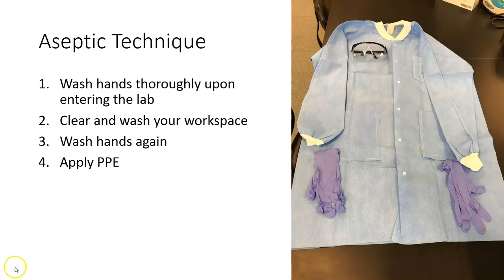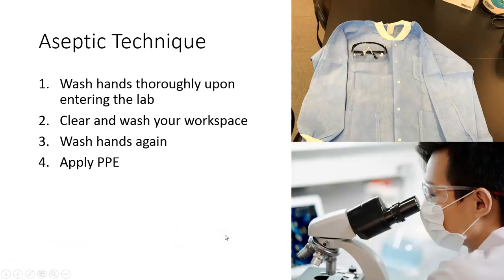Be certain that if you're wearing goggles in the lab, which you should be, the goggles have closed sides like these, so that splashes that might occur to the sides of your body still won't reach your eyes. You also want to make sure that your goggles are ANSI Z87.1 rated. This means that the goggles will protect against impacts, UV light, and chemical injury.